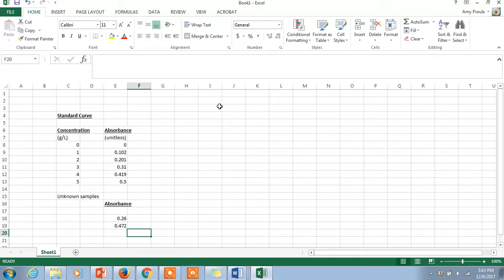And so I assume that you have done an experiment where you have made a standard curve of solutions of a known concentration. So perhaps I just arbitrarily said, okay, we've got a concentration of 0 grams per liter, 1 gram per liter, 2 grams per liter, 3 grams per liter. This is where you're measuring the performance of a known sample and figuring out what sort of absorbance levels you're going to get. And from there, we've got to take it backwards.